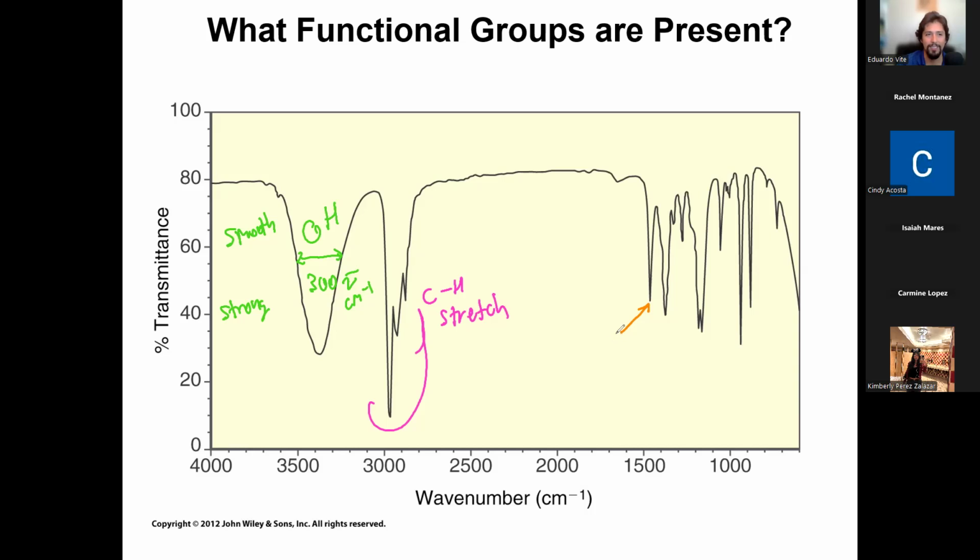Yes, right? Yes, Isaiah. The carbon-carbon double bond right there. So this is about 80%, I would say, right? It's also possible that it's not. So I would say, well, that kind of looks like a carbon-carbon double bond. And then my lab partner might say, well, I wasn't trying to make anything with a double bond. Oh, okay. Well, either you accidentally made something with a double bond or I'm reading the spectra incorrectly, right? There's always two possibilities.